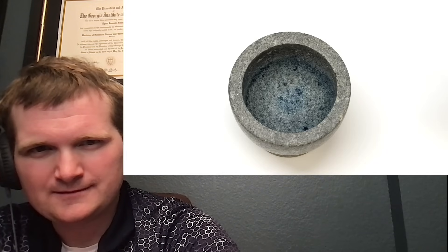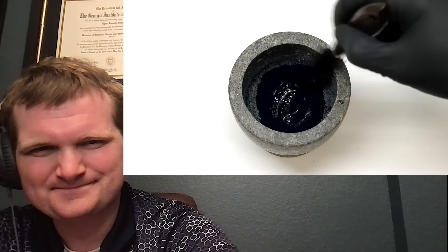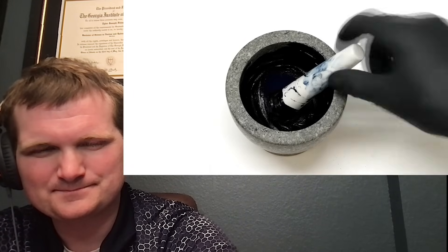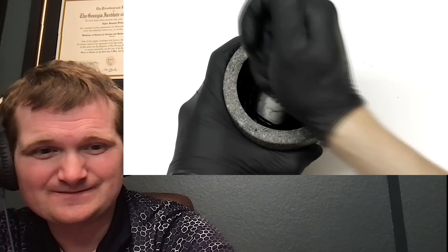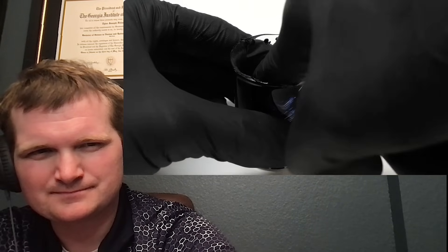I added about two grams of the Prussian blue, then poured in some linseed oil. I mixed it around, and it looked like there wasn't enough oil, so I added some more. Unfortunately I added way too much and had to balance it out with more pigment. The final consistency of the paint depends a lot on the preference of the artist, and I just stopped when I felt it was thick enough. To get it out of the mortar I just scooped it out with my finger and scraped it into a small beaker. I planned to use it all right away, so this was fine, but if I wanted to store it I would have sealed it in a paint tube.